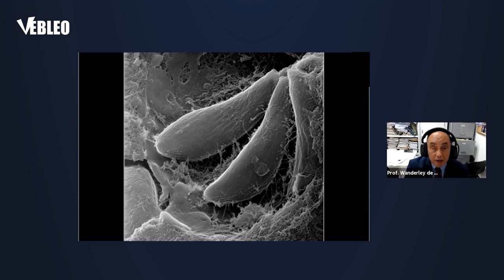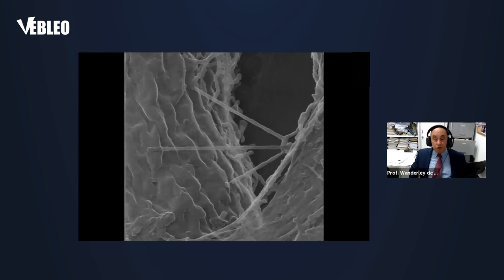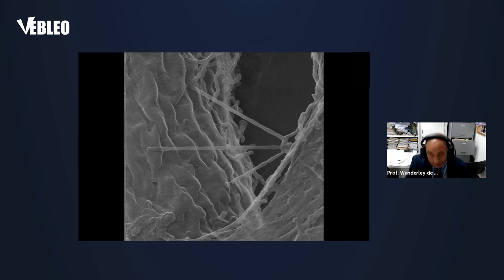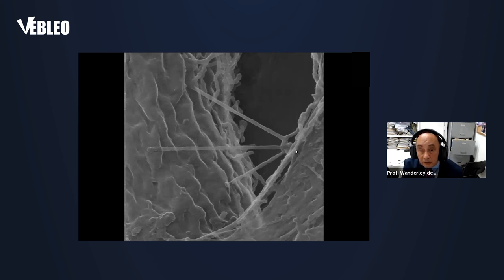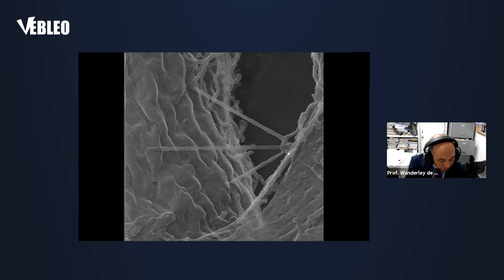If this sample is coated with platinum, the nanotubular network cannot be clearly resolved. Using helium ion microscopy however, they can be clearly visualized. Here is the surface of the parasite, the inner membrane surface, and you can see the organization of these nanotubular structures that extend from the surface of the parasite toward the inner surface of the vacuole, forming a very complex network where substructures can be visualized using this high resolution microscope.